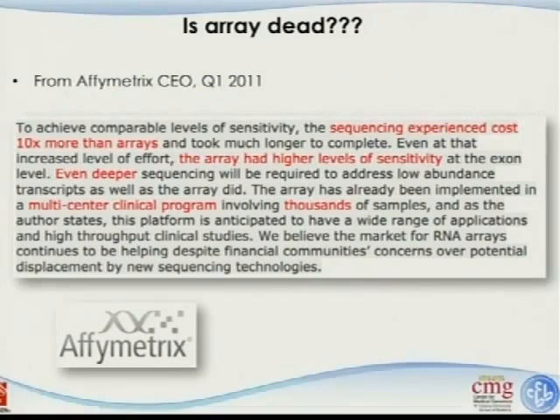Yes? You also mentioned the targeted sequencing. So Jake is asking about the targeted sequencing. Actually, targeted sequencing is on the DNA sequencing. So it's not really trying to measure the gene expression level. It's trying to identify the genetic variations in the exons. It's not the RNA part of it.